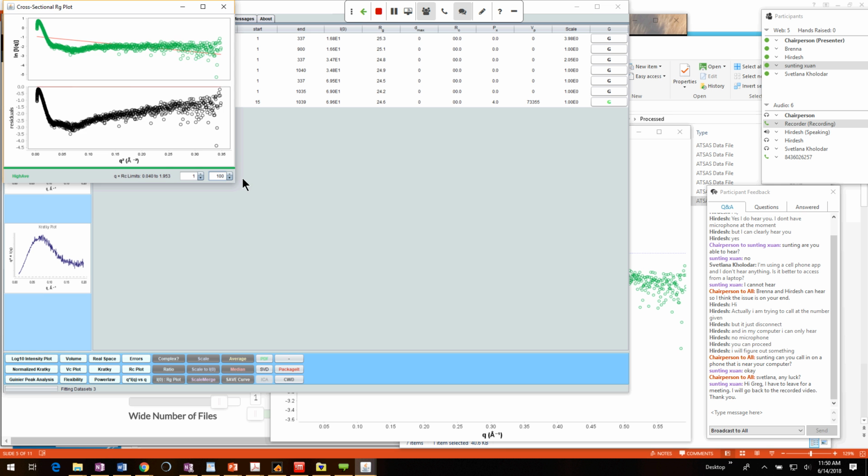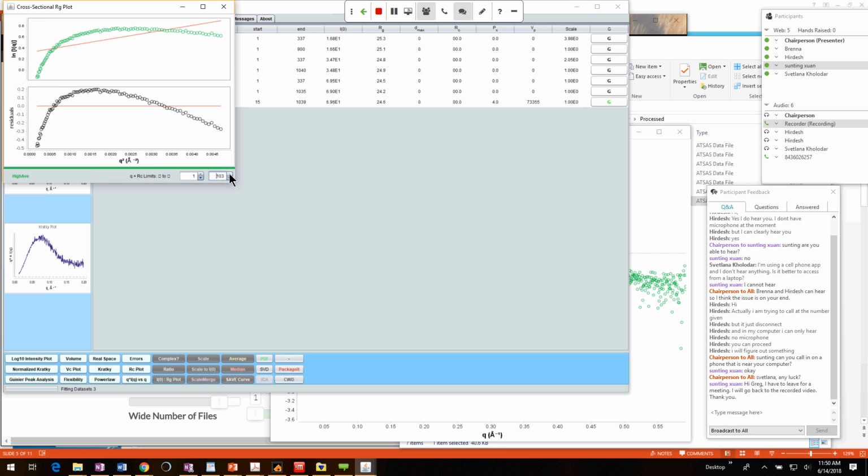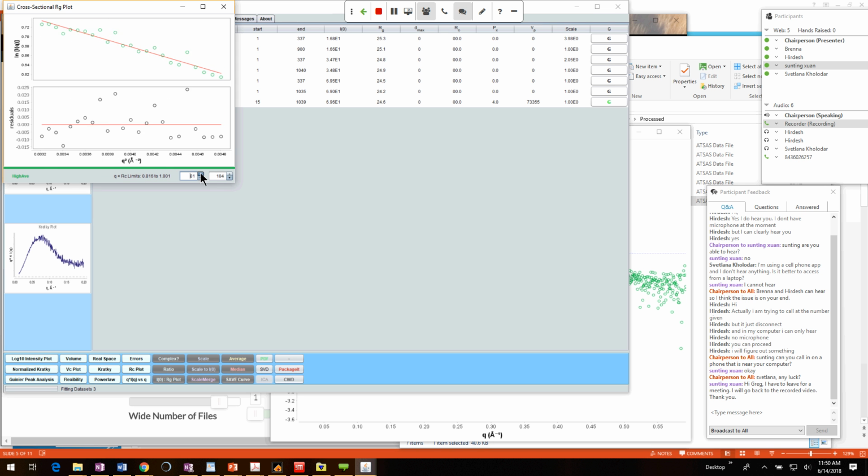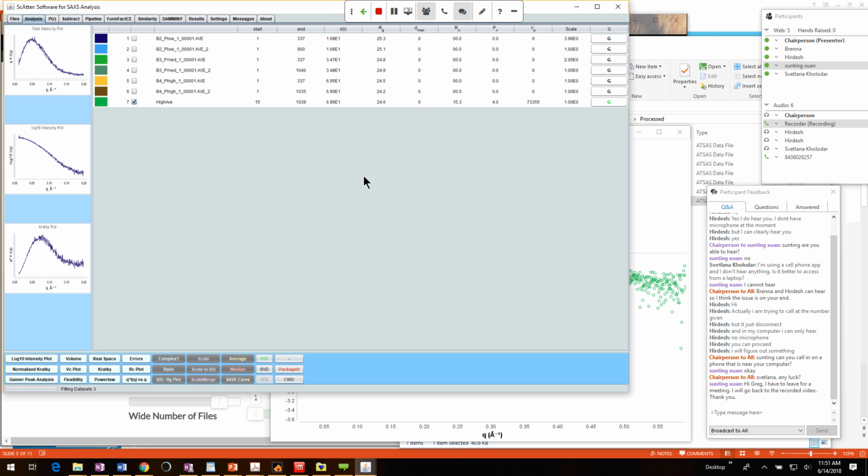What I'm doing here is just fitting these lines. Right after the Guinier region is where you measure the cross-sectional radius. I want to fit a line through this. And again, this is something you can do in Primus as well. So some kind of line through this. Okay, and then the cross-sectional radius here is 15 angstroms. The radius of gyration is 24 for this particle.